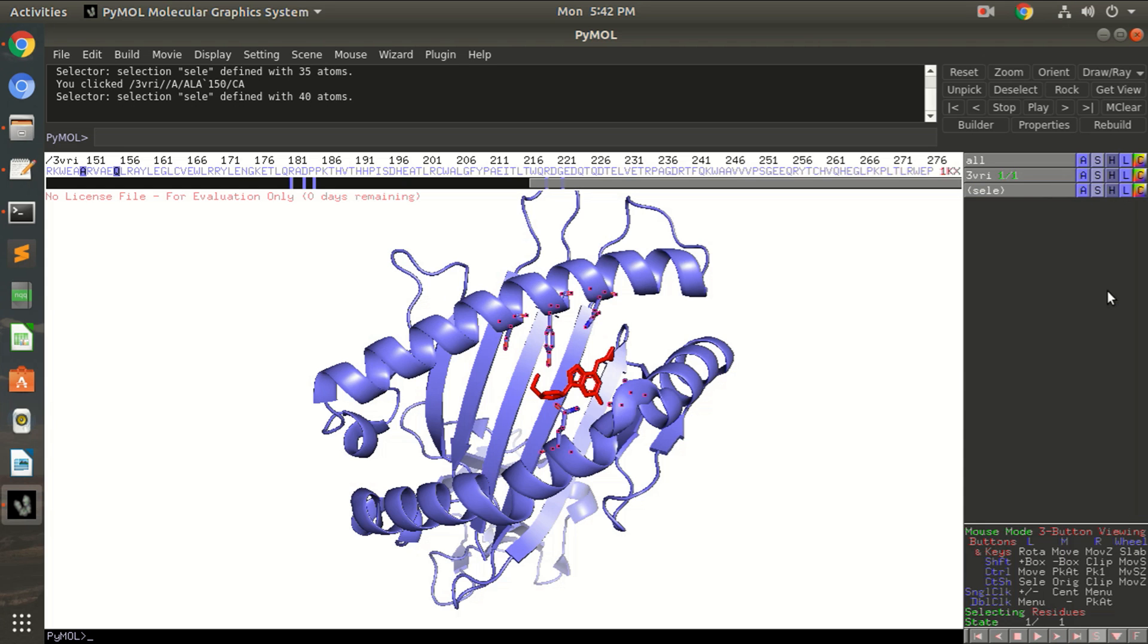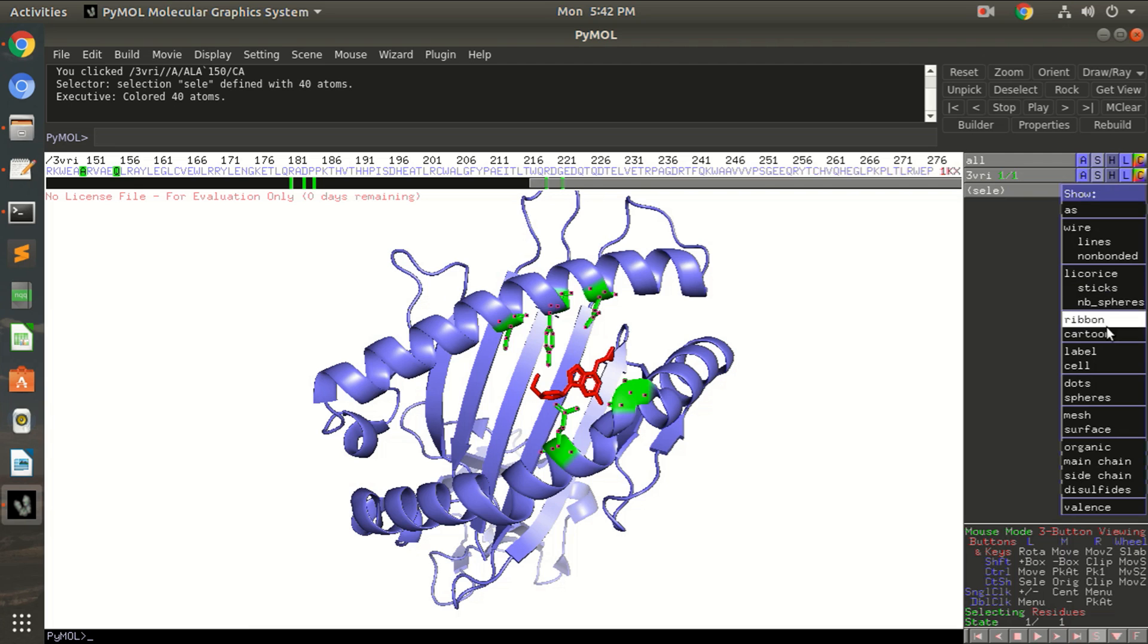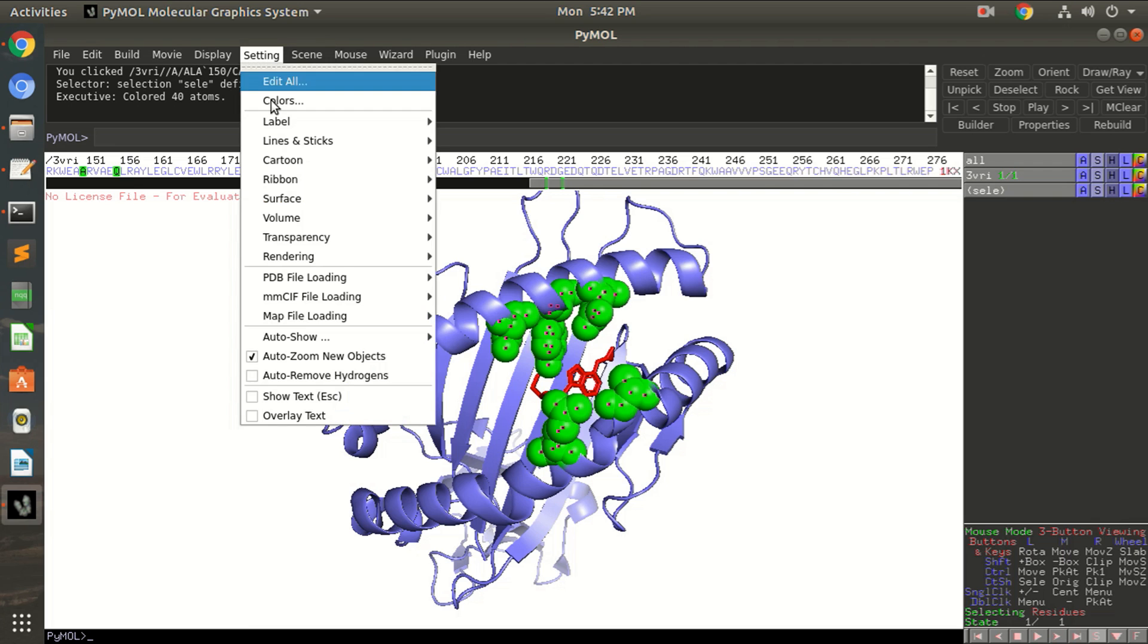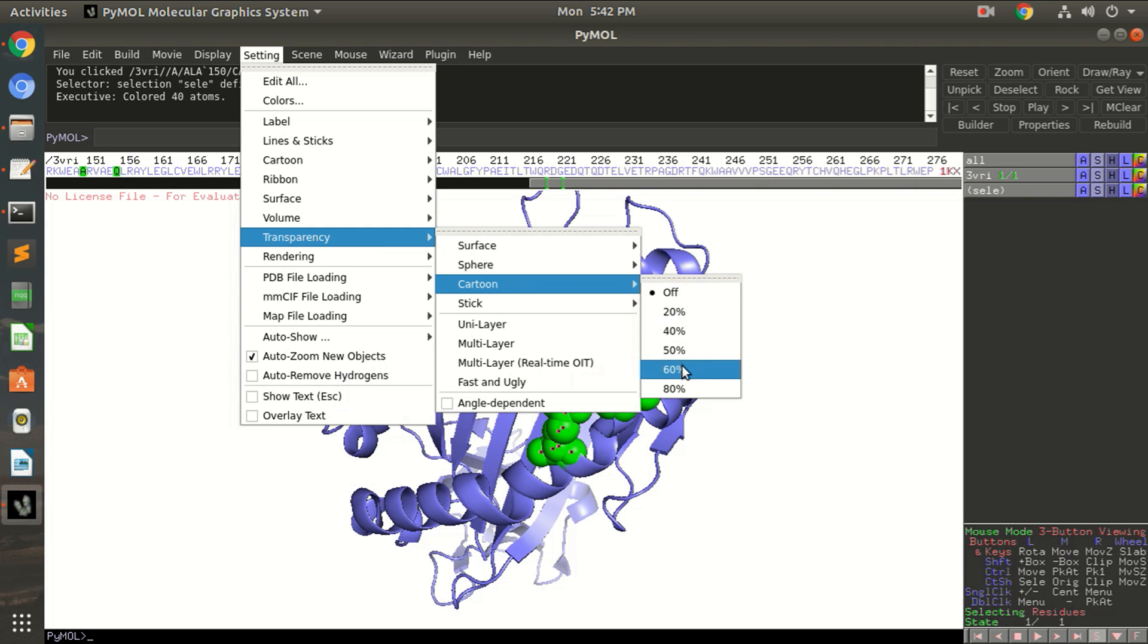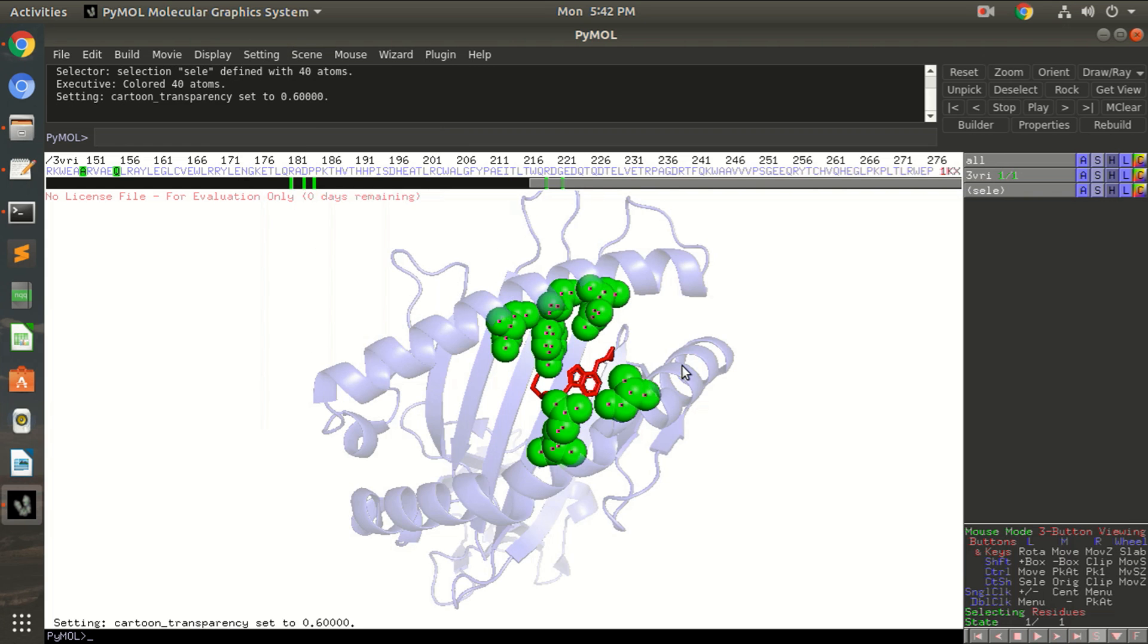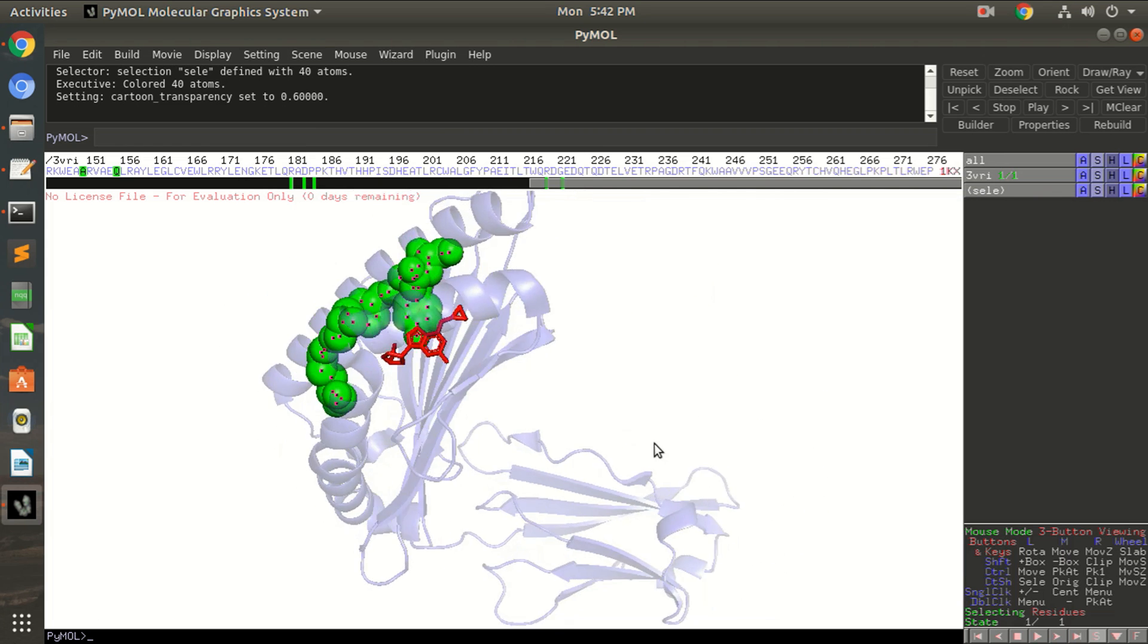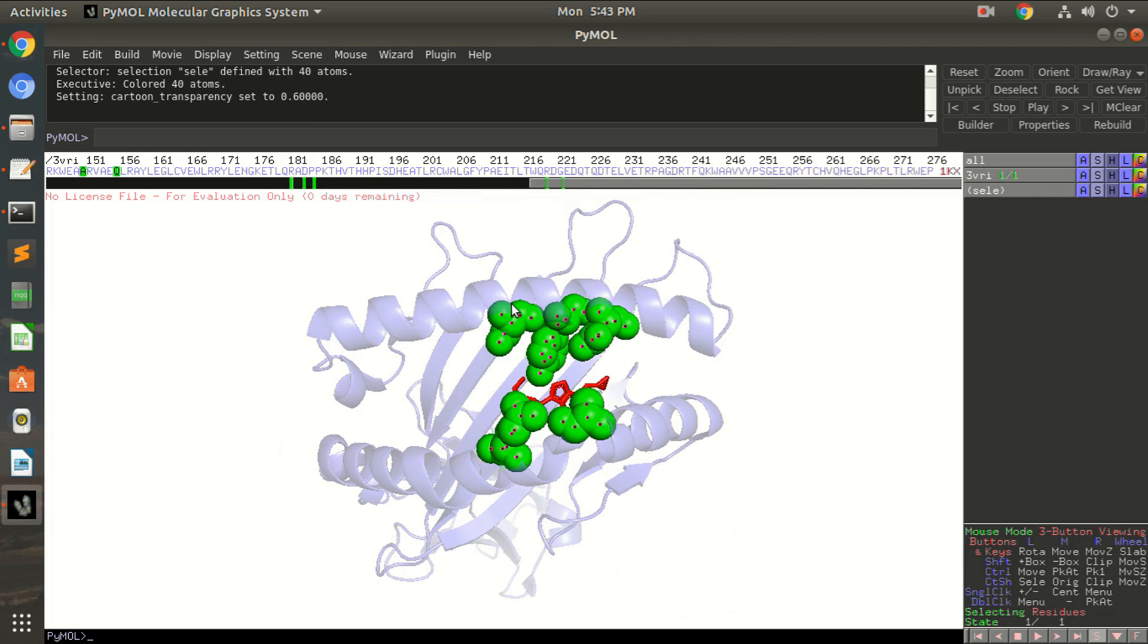And show them as sticks. Okay, if you want to change the color then you can change the color as green. But if you want to show these residues as spheres, so you can change it here. Okay, so you can see them as spheres. But if you want to hide the background protein and just make it a little more transparent.